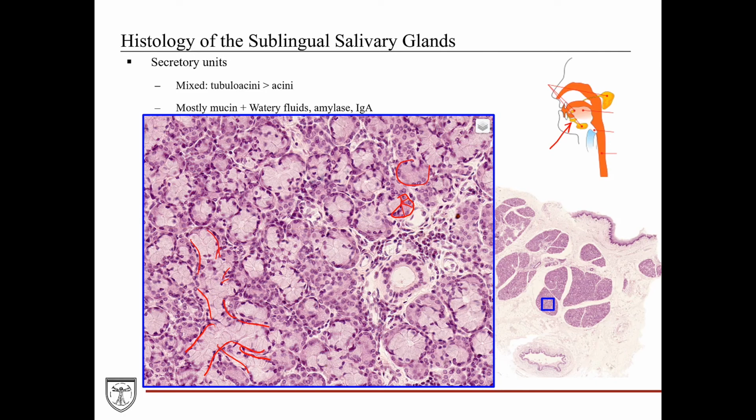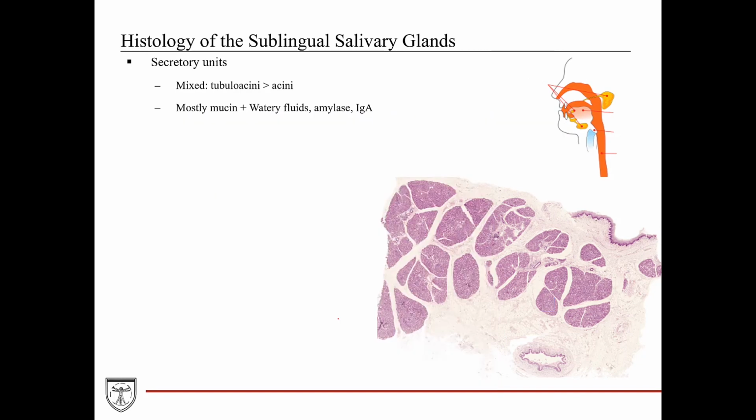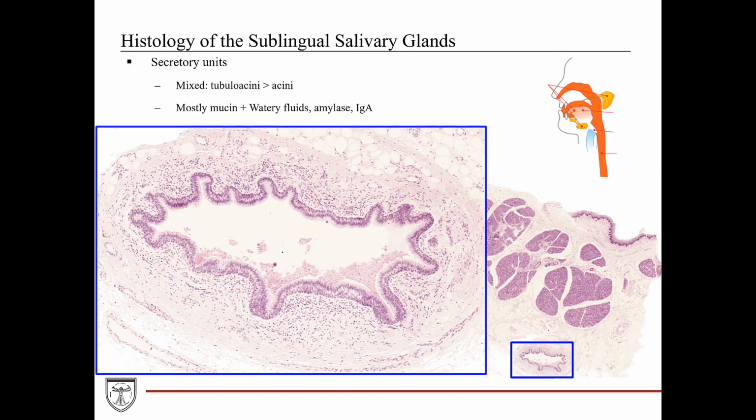In this particular image, we're able to identify one striated duct, and there doesn't appear to be any apparent intercalated duct within this section at this time. In this macroscopic image, there's a couple of other anatomically interesting features, so let me highlight those. Here in the boxed area is a structure with a large lumen in the middle. At higher magnification, we realize that this is also a duct. This is one of those larger ducts that drain the entirety of the sublingual glands.